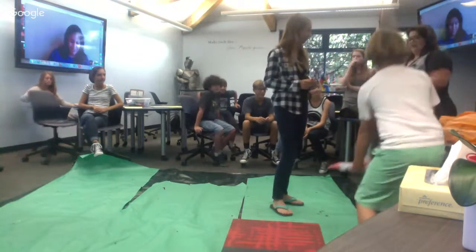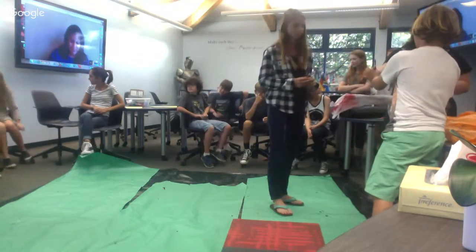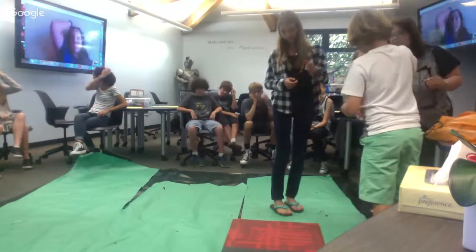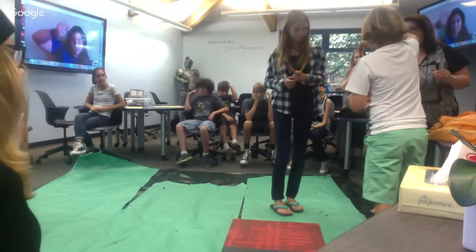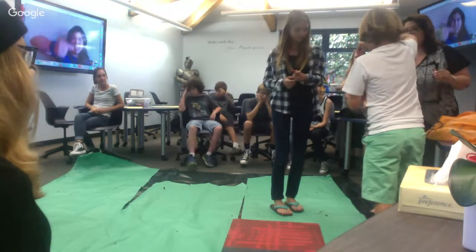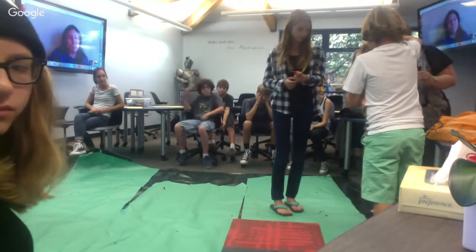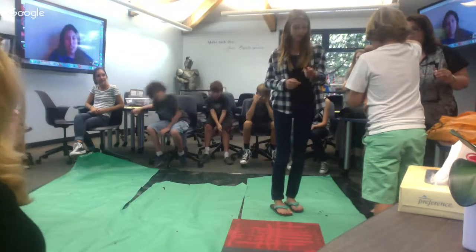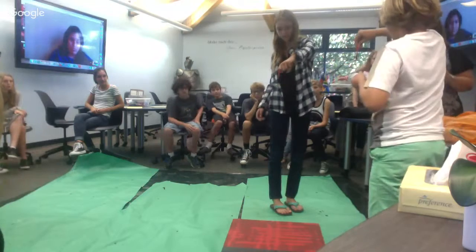Okay, so then on the hand, what do you want them to do? On the hand, drop it onto the fabric, and try to drop it at a complete 90-degree angle, and then you should be able to see how the material absorbs it. Because each material is going to absorb differently, as well as it's going to drop differently onto the material. There you go. That's good.